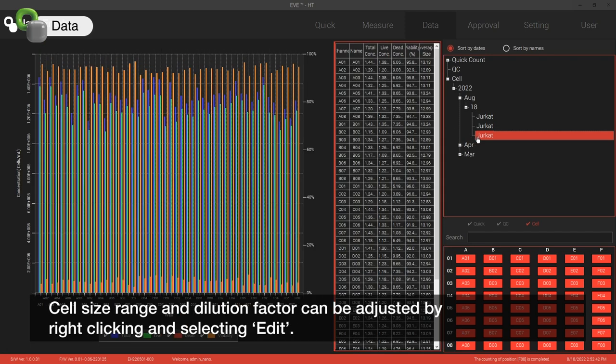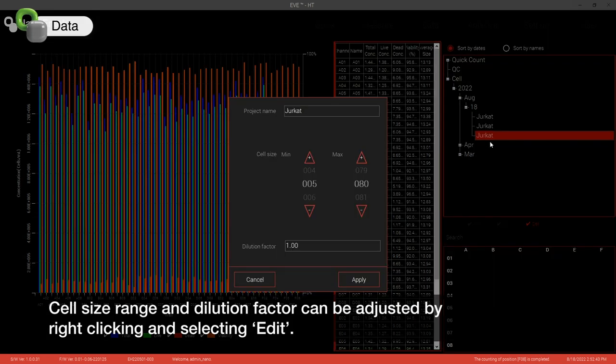Cell size range and dilution factor can be adjusted by right clicking and selecting Edit. Click Edit.